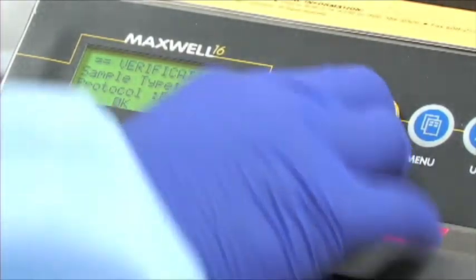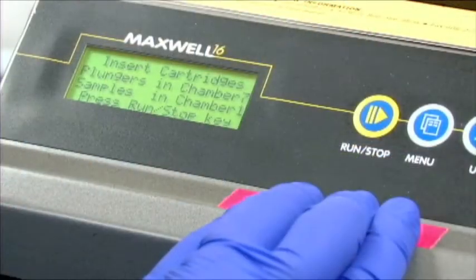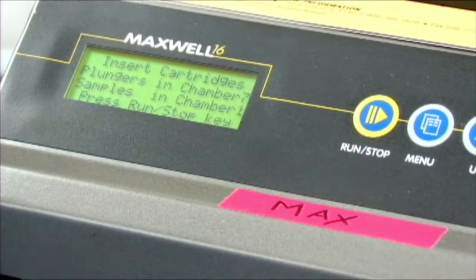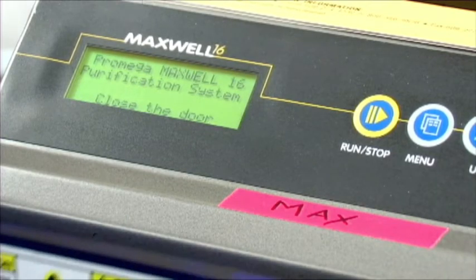You get the cartridge, you add your sample, you add your plunger, you label your elution tube, you put it in the system, and then Maxwell asks you: do you have your cartridge? Do you have the plunger? Do you have the elution tube? So it's just so easy. It's really the easiest thing to train anybody on for what we do here in the lab.